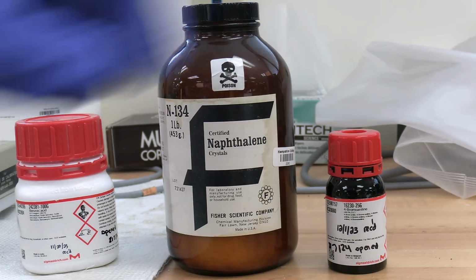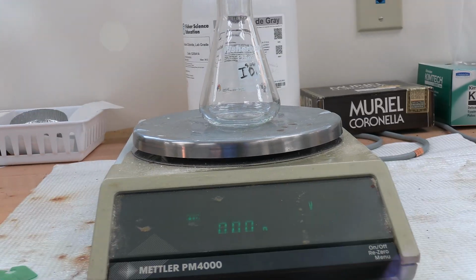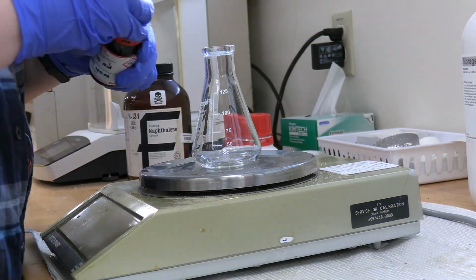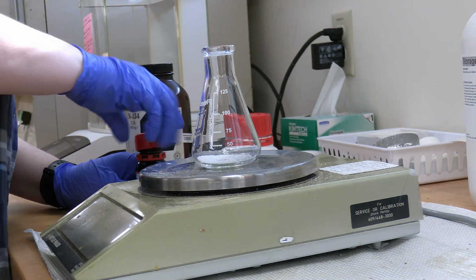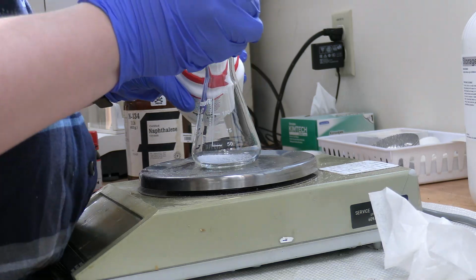This sounds easy enough. To do this, I obtained a 125 milliliter Erlenmeyer flask and placed it on a scale, then pressed the 0 button. This will reset the weight to 0, subtracting the weight of the flask from the total weight recorded on the scale. This allows us to take 2 grams of each of our products and add it into the flask. Your total weight when you've added all 3 solutes should be around 6 grams.